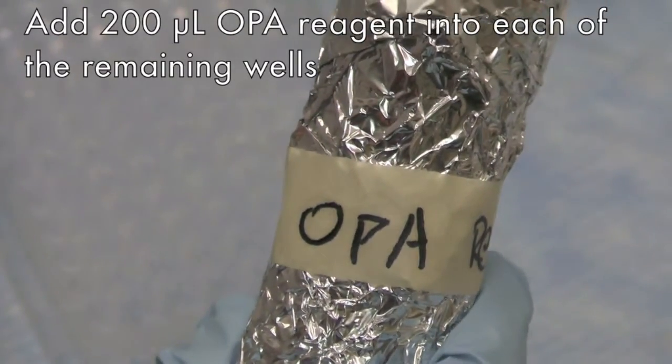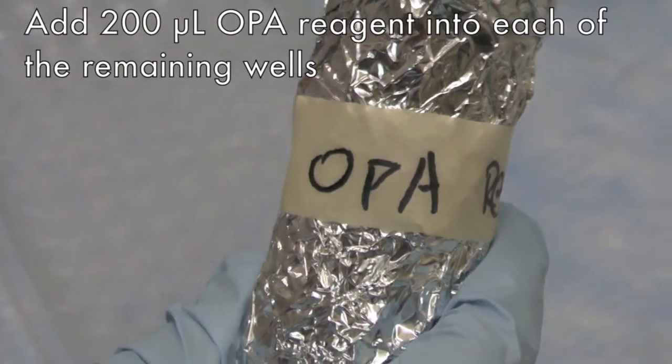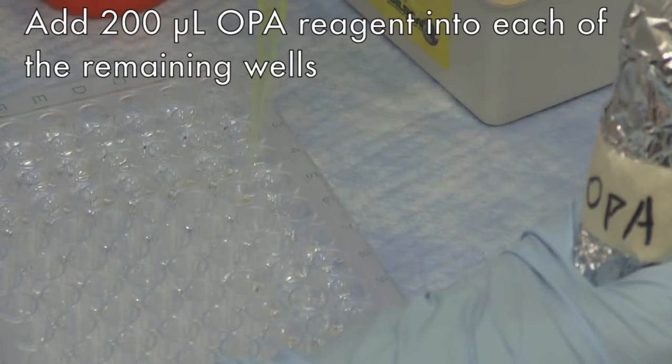Then, pipette 200 microliters of OPA reagent into the remaining wells containing sample or standard.